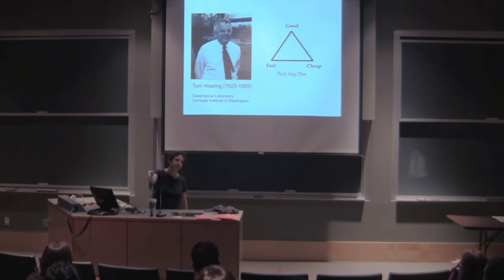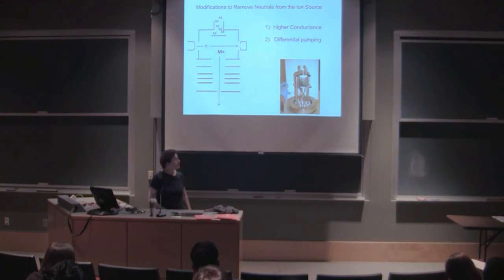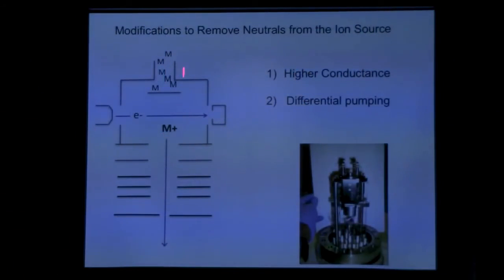So now we've separated our compounds. We've burned them up. We're sending the compound products into the mass spectrometer. And we've got this problem that we've got a lot of carrier gas going into an instrument that was designed to have really low vacuum, really low pressure, or high vacuum, low pressure. So there's been some modifications based on the original sort of mid-20th century instruments that allow us to accommodate this flow of gas. And they start with what's happening in the ion source. In the ion source, you have neutral molecules. They come in, and then they get smacked upside the head by a high-energy electron, and that gets them so upset that then they lose their own electron, and they become a positive ion. And so that's all very good, but we have now not just the CO2 or the other compounds we're interested in. We also have this helium in there. So you're making a lot of helium ions as well as the analyte.